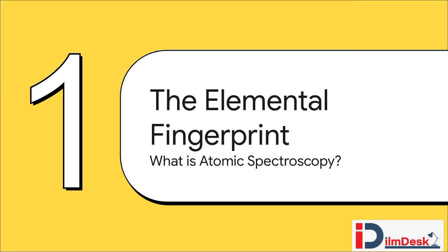So, if we're going to learn how to read these elemental fingerprints, we first have to get familiar with the tool for the job. So let's ask the big question. What exactly is atomic spectroscopy?